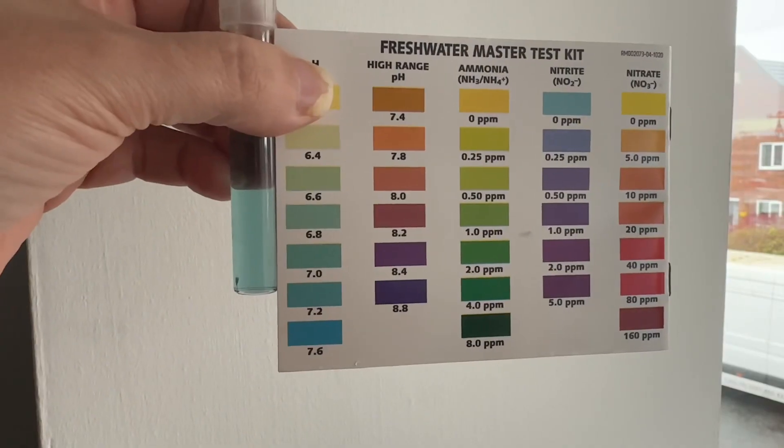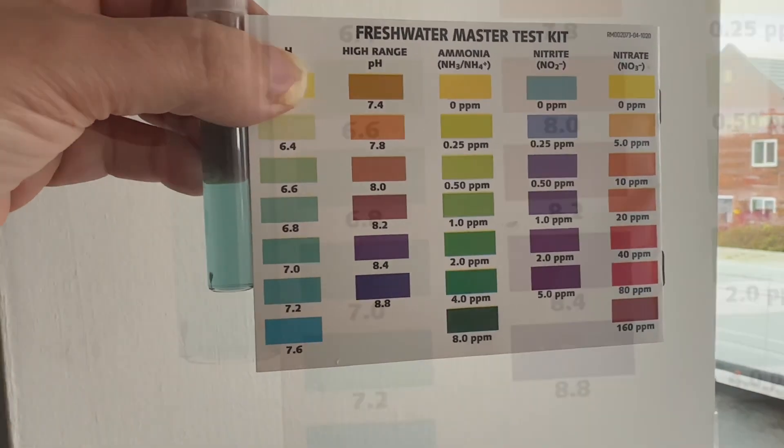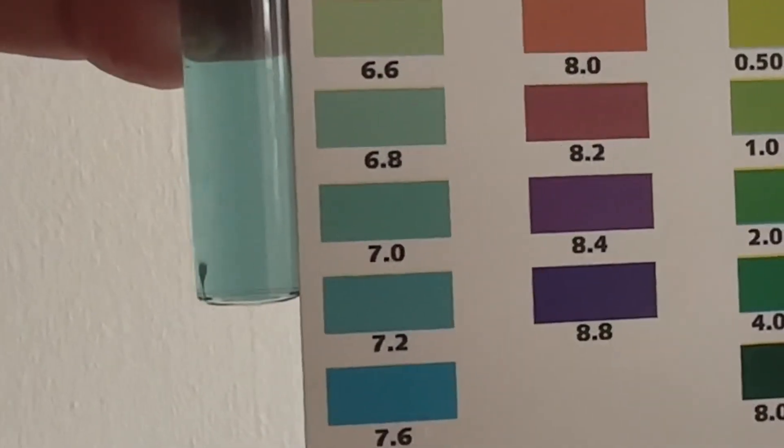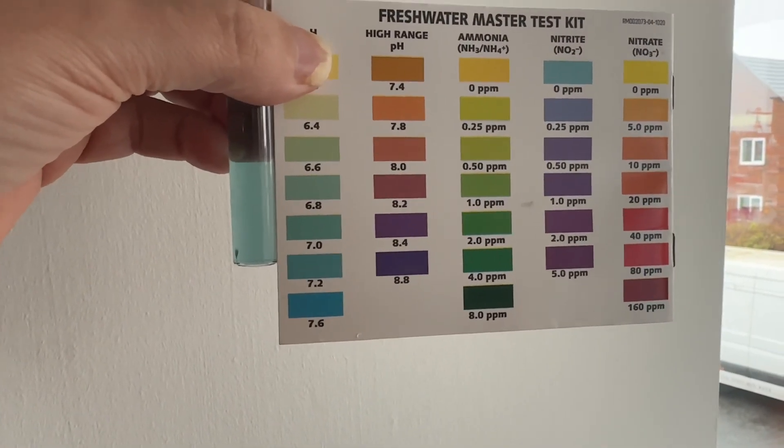How accurate is a cheap pH tester off Amazon? Let's dive right in and do a quick test. With the API kit, it's showing between 6.6 and 6.8 — there's the pH.